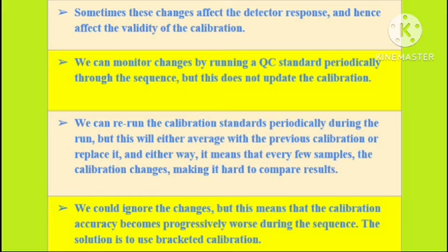To ensure the total sample analysis is completed without any interruption, that is, during the analysis errors can occur like pressure fluctuations, column leakage, etc. The bracketing standard has to be compared with the system suitability injection to ensure the entire analysis completed without any interruption like those mentioned above.